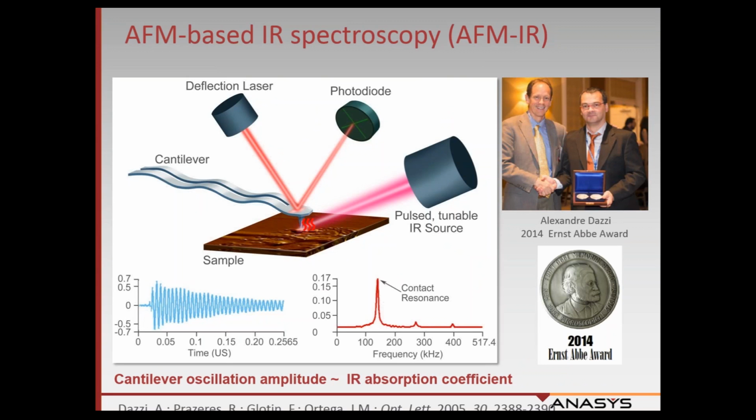materials that have good reflectivity. And so really these are complementary techniques providing somewhat different information and working best on complementary samples. So really the combination of these two techniques gives you a very high performance system.